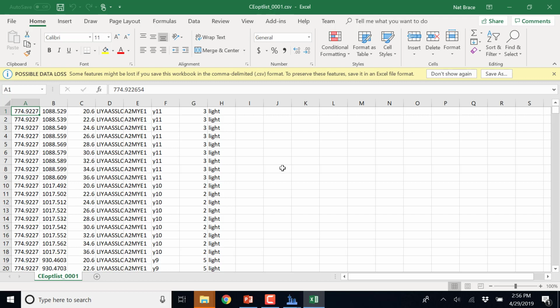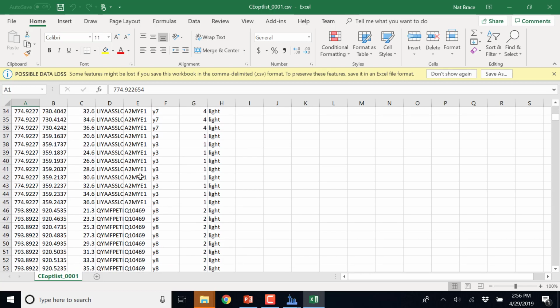For this first product ion, it's going in 2-volt increments. It's trying a different collision energy for that product ion. And then when it goes to the second product ion, the 1017 from that same precursor, it's going over that same range. So these 2 product ions may prefer different collision energies for optimal fragmentation, and Skyline will pull that information out. So you can see we've got a Y11, Y10. If we go down the list, this is how the whole process occurs.